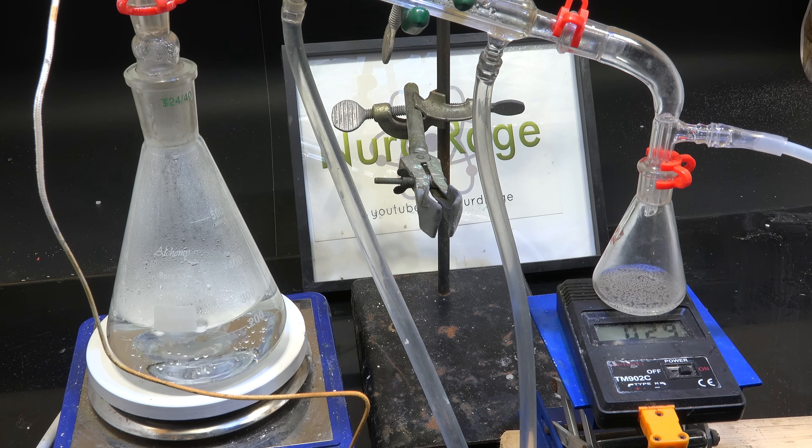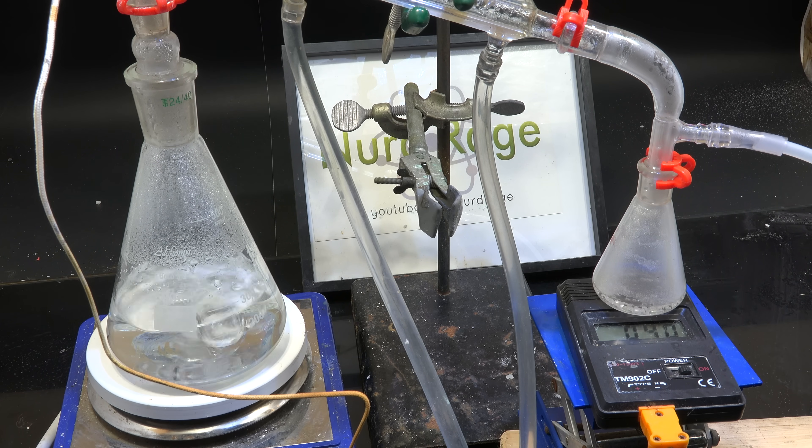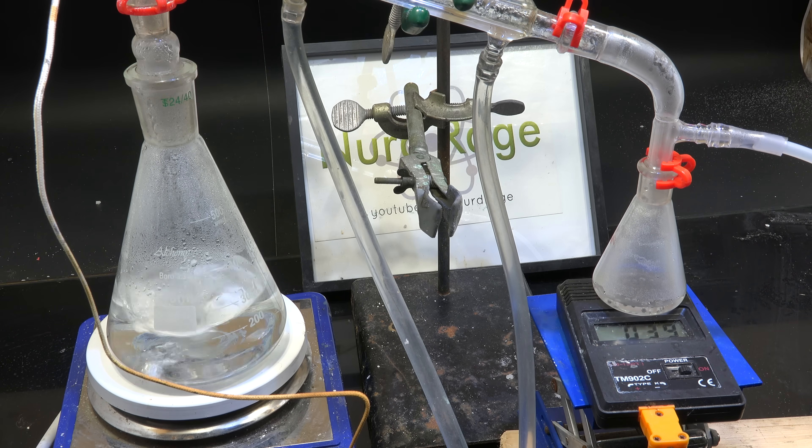If this works we should be distilling water at below the normal boiling point of water. Reducing pressure has the effect of lowering the boiling point for all liquids. And look, there it is. We're already distilling water under reduced pressure at just 39 degrees celsius. That's far below the normal boiling point of water at 100 degrees celsius.